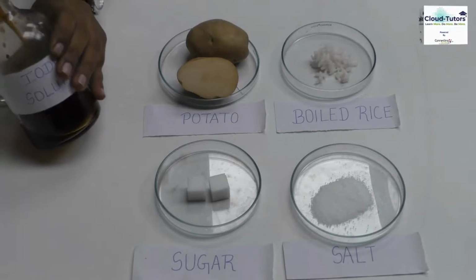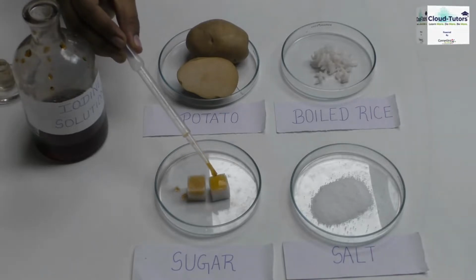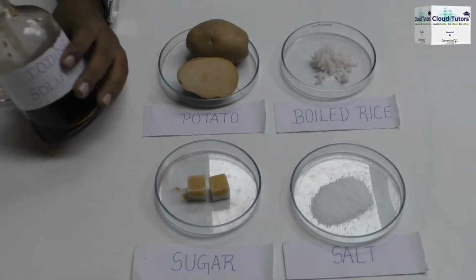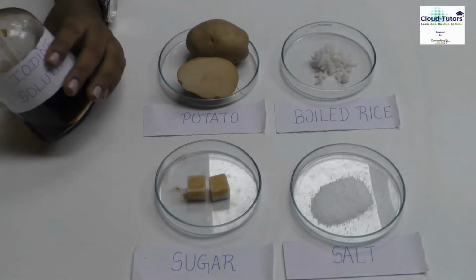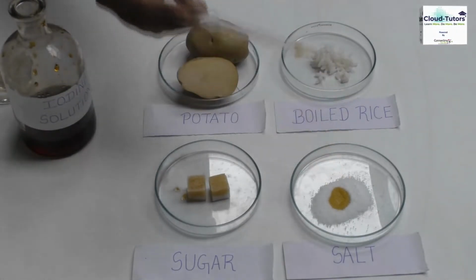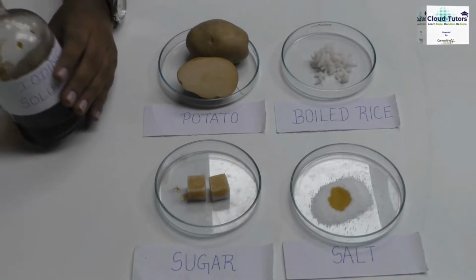So I'm taking a few drops of iodine solution and dropping it on our sugar cubes. As you can see, the iodine solution is kind of orangish yellow and the sugar cube hasn't changed any coloration. Now coming to our salt crystals. If I drop iodine solution onto the salt crystals, the coloration is as it is. Now we will go to the potato sample.